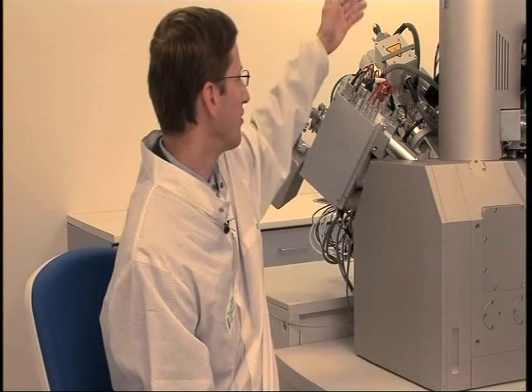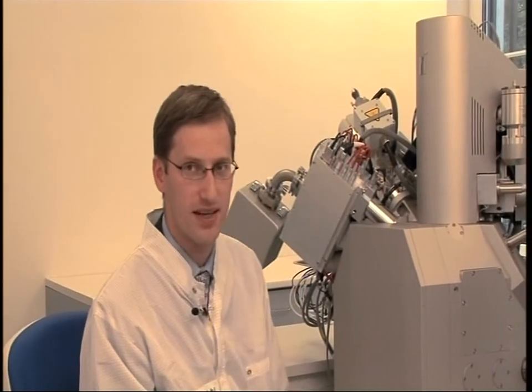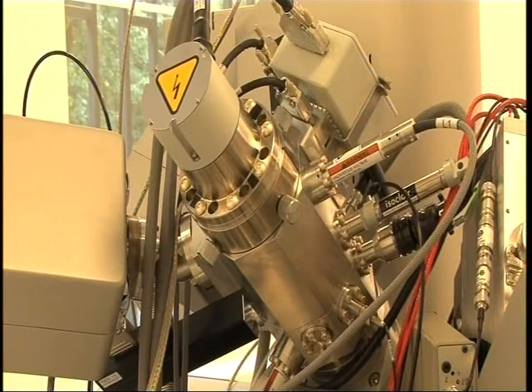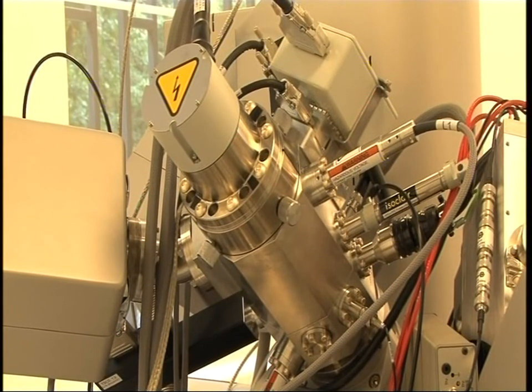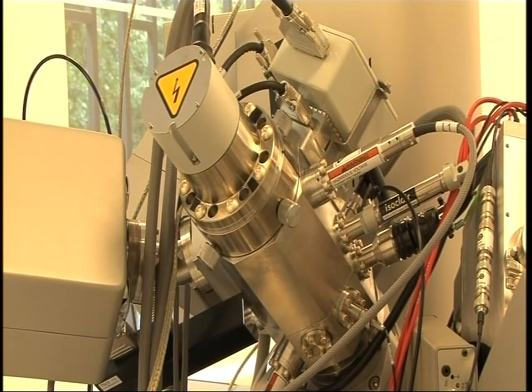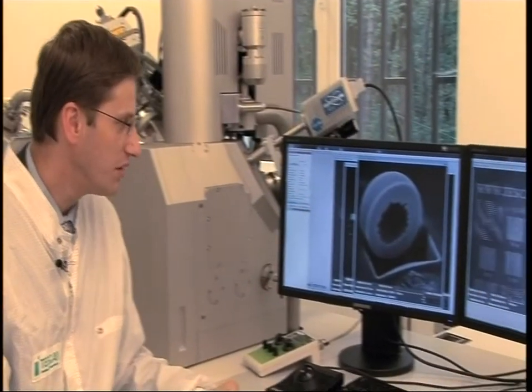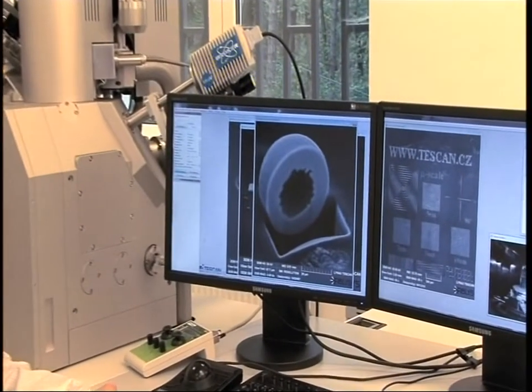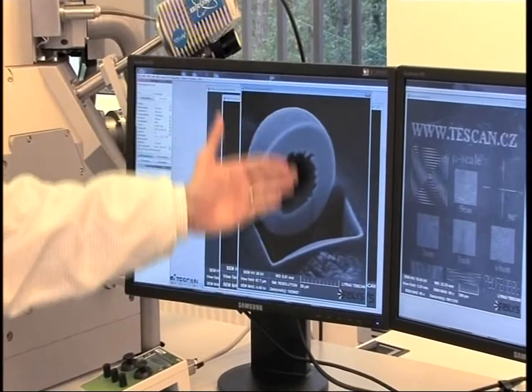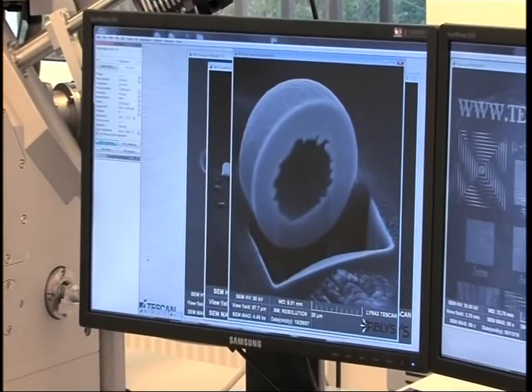So far, we have only viewed the sample. Now we want to change it, modify it, or generate it. The focused ion beam serves this purpose. The tool allows adding or removing material from our sample. Here, for example, we see a particle which we have cut in half. As a result, we can look inside.